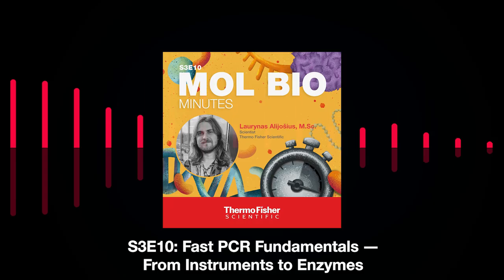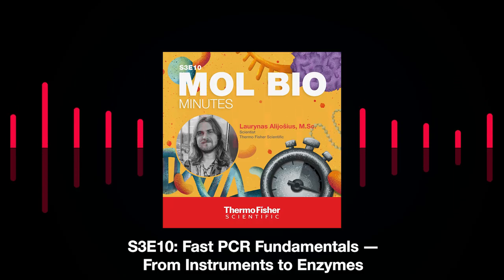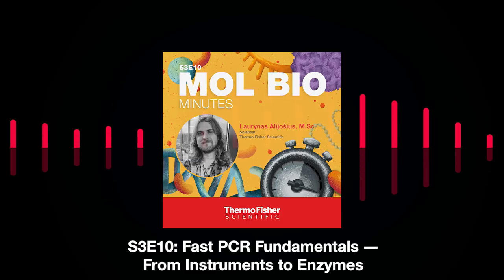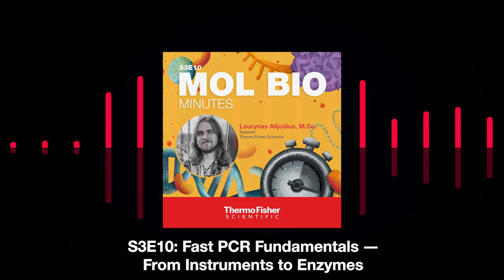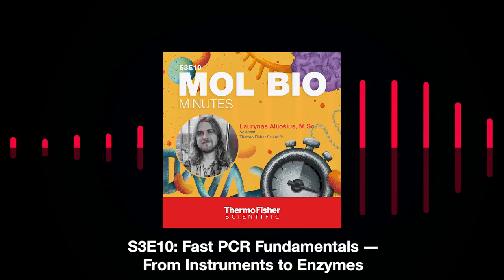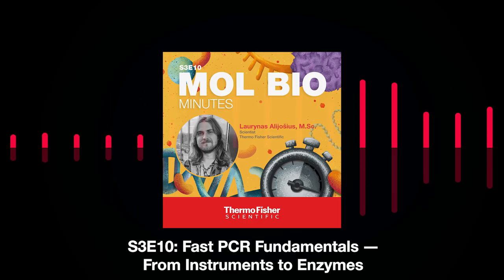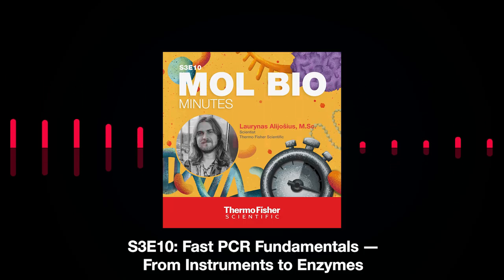Next cool trick for your cycling program could be shortening the steps of your PCR protocol that we just mentioned earlier. So just using a two-step protocol instead of the standard three-step, that can also significantly shorten the duration of your PCR cycling program. We did that, but what else? Maybe we can shorten something else.